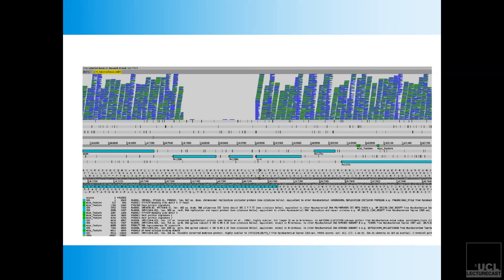So before you get to this, I think you'll discuss a bit more the number of steps which you need to do, to look at how good your reads are, and so on and so forth. So this is almost towards the end. You're seeing how it is looking. Where the reads are aligned to the reference, you see that. Where you don't see them aligning, it means that it's not present as far as the reference is concerned.